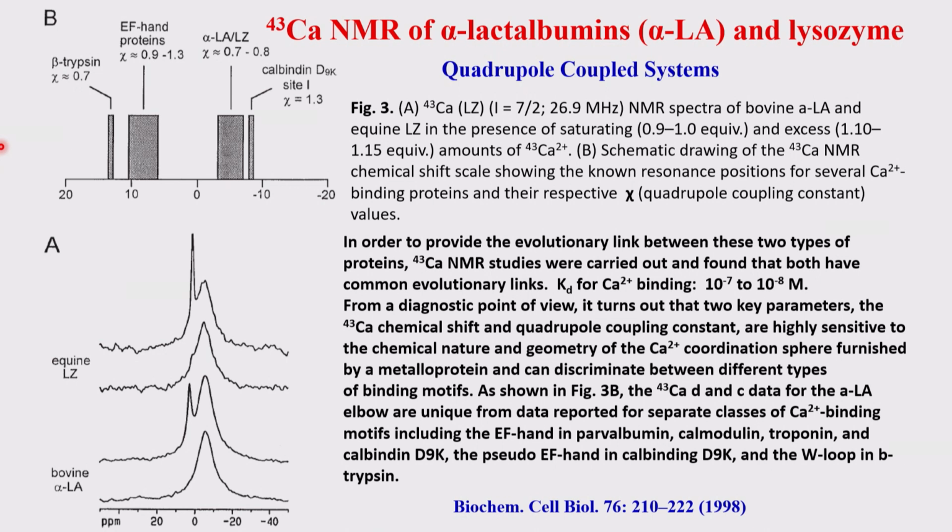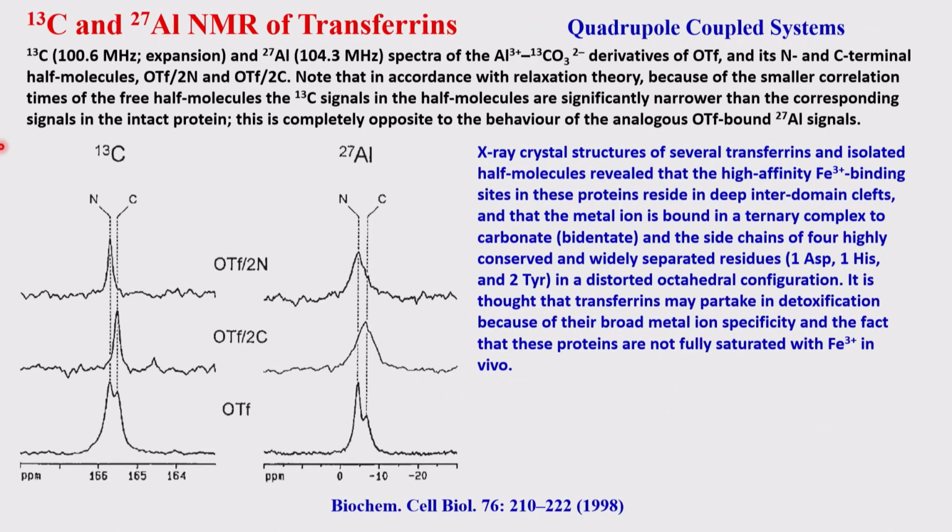And in addition, if you use some binding strengths from other techniques, you can evolve with the structural aspects of it. So this is one class of proteins. Let's look at another class of proteins called transferrins. Transferrins are the iron carrying proteins. The iron is being carried through the blood to different organs of the body, and that is where.